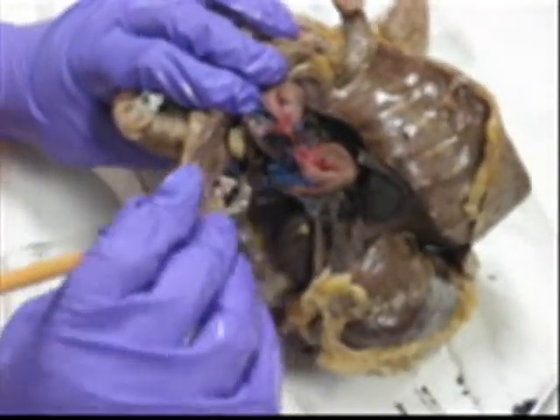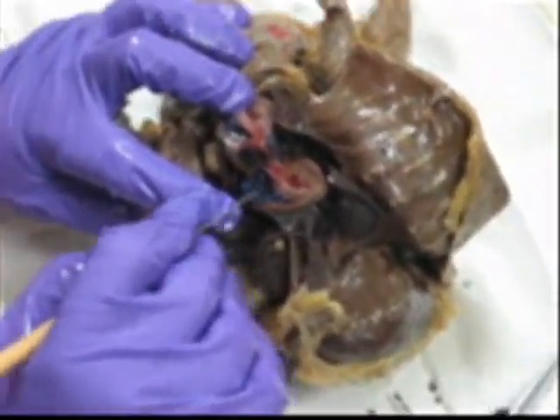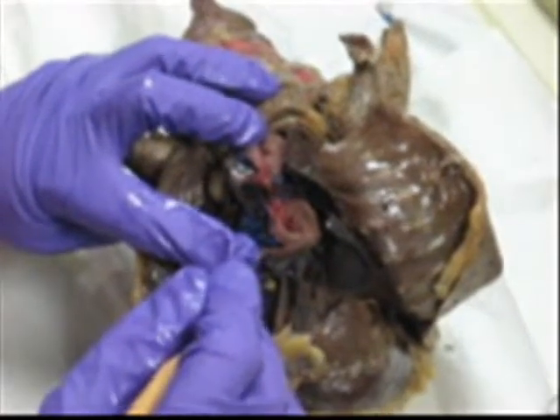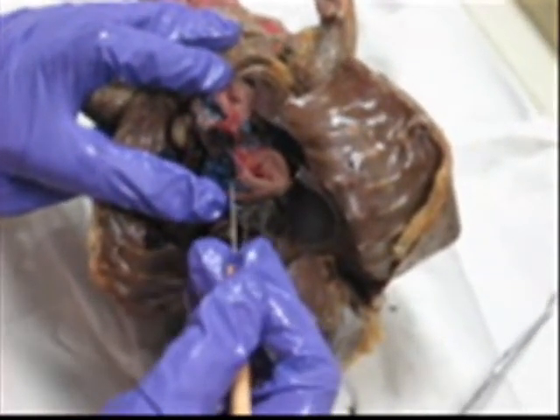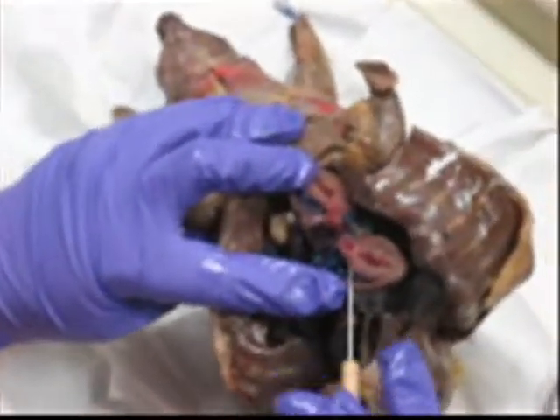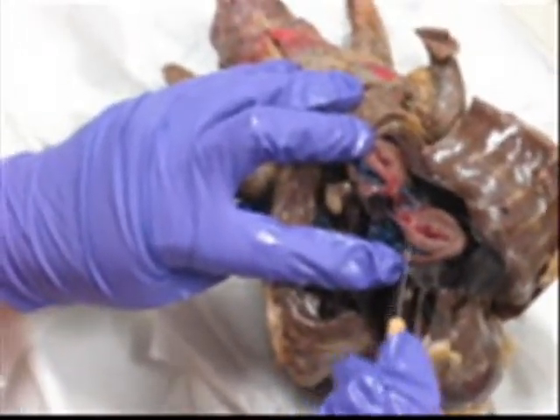And if you're super careful, you'll be able to clean this out — the chordae tendineae. Do you see the little chords? They are very delicate. I don't think I can quiz that, but be aware that it exists.